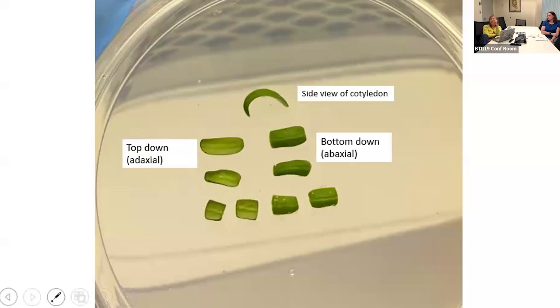We knew they were transformed because we tested that later, and we added some indole acetic acid to the rooting medium to get those to root. If we have transformants that we know are transgenic but are having difficulty rooting, then we'll use IAA. Do you remember the concentration? I believe it was 1 mg per liter. For some we did 0.1, so I'd have to look which was which. But we did add IAA to the medium.